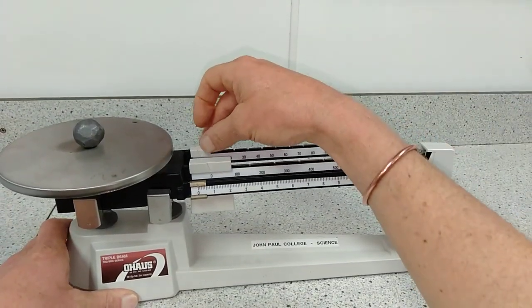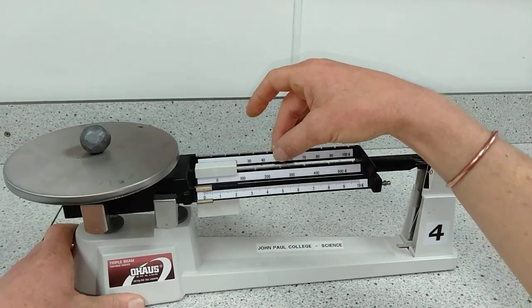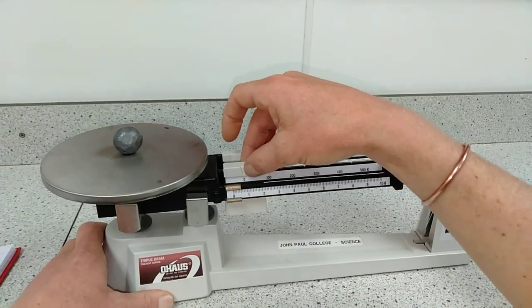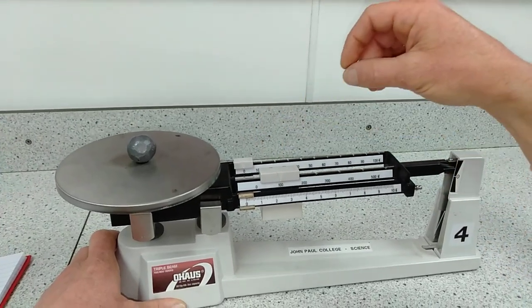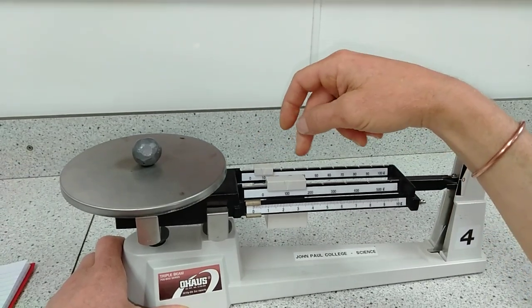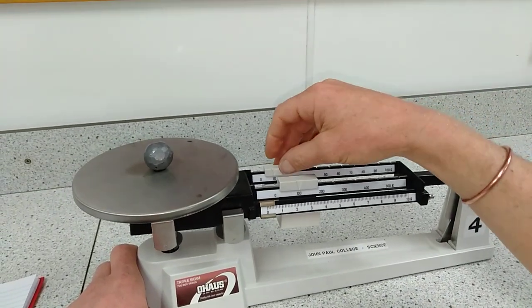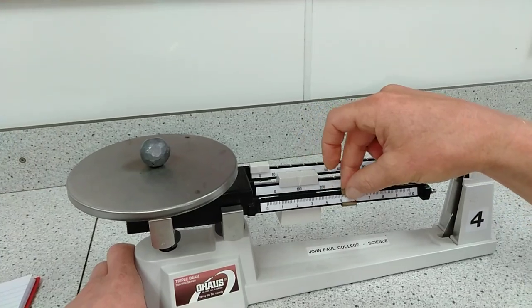The first thing we'll do is move the tens and see whether it starts to balance out the lead weight. We get up to 100 and we notice it isn't balanced out, so we move it back and move the hundreds up to 100 and then start adding more tens. We notice that the 110 pushes it down, which means that the lead is less than 110. So we push this back to 0 and we start measuring, pushing the 1 up.